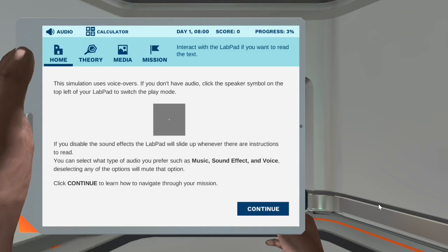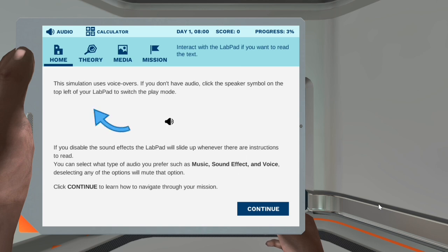This simulation uses voiceovers. If you don't have audio, click the speaker symbol on the top left of your lab pad to switch to play mode. If you disable the sound effects, the lab pad will slide up whenever there are instructions to read. You can select what type of audio you prefer, such as music, sound effects, and voice. Deselecting any of the options will mute that option. Click continue to learn how to navigate through your mission.